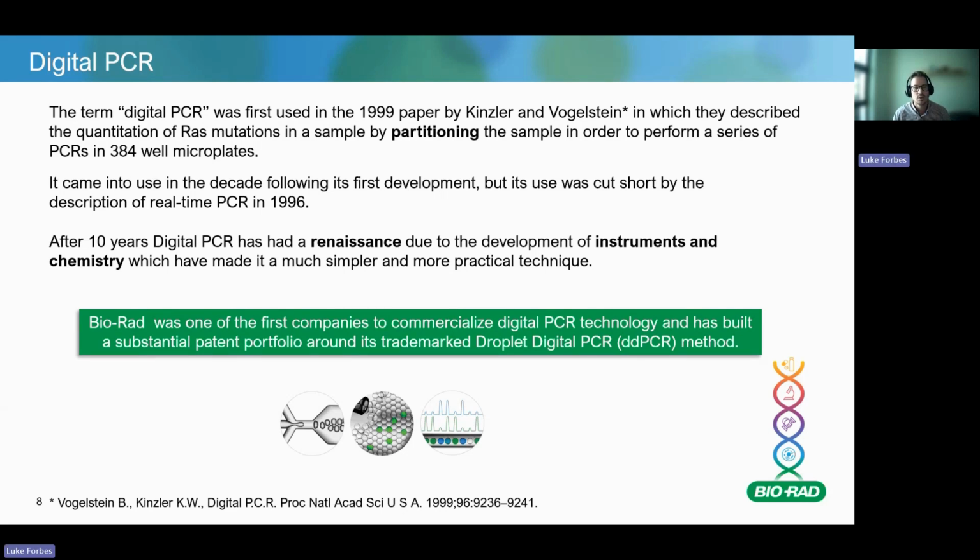But what was sort of the limiting factor of digital PCR for a long time? Well, like most things that are sort of happening in modern science, the technology was the limiting factor. So the biggest issue was having sort of accurate partitioning. Accurate partitioning is sort of the most essential part of ddPCR, because your samples all have to be divided into the same sizes.